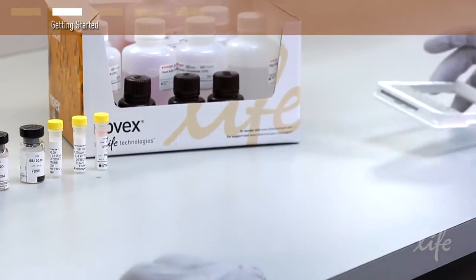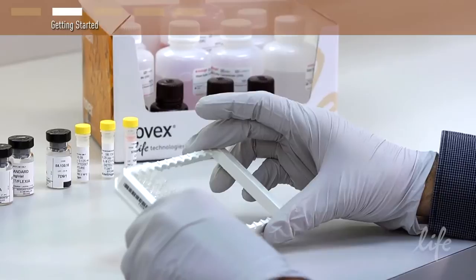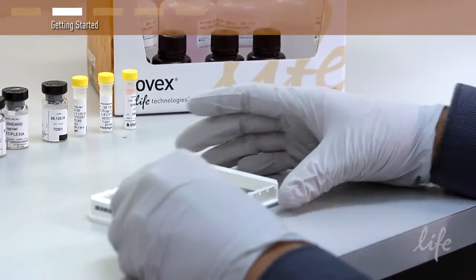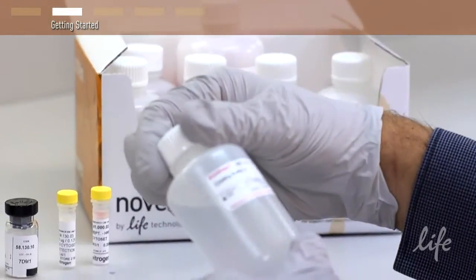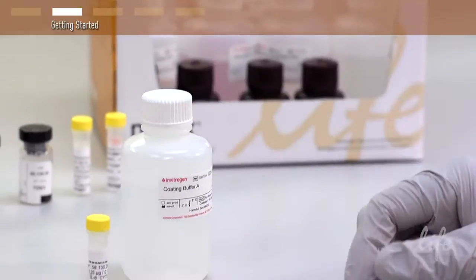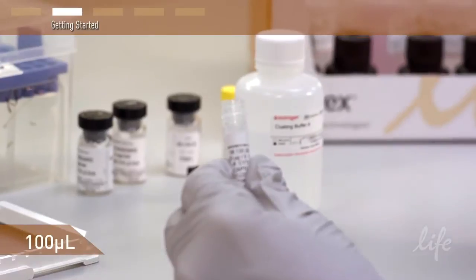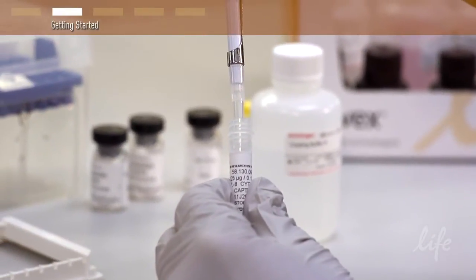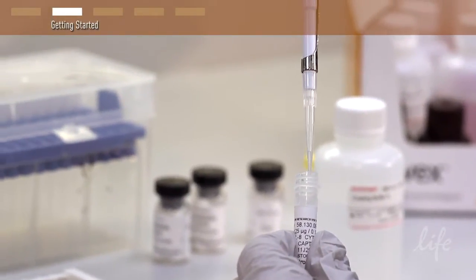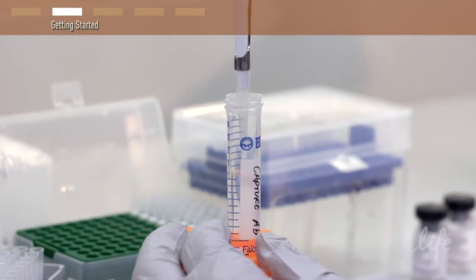The first step is to prepare the capture plates. Using the provided coating buffer, make a capture antibody solution by diluting the capture antibody in the coating buffer. Prepare enough to coat each well with 100 microliters. You may need to determine the optimal capture antibody concentration for plate coating. The suggested concentration is provided in the kit's technical data sheet.